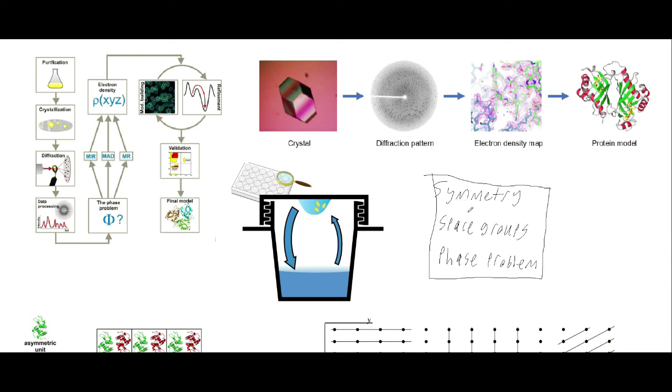And probably why it's also increasingly becoming more desirable. There are a lot of issues with X-ray crystallography that don't come up really in cryo-electron microscopy.